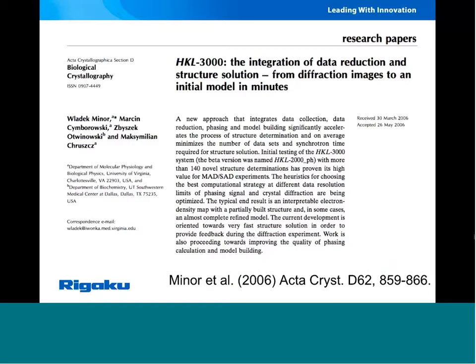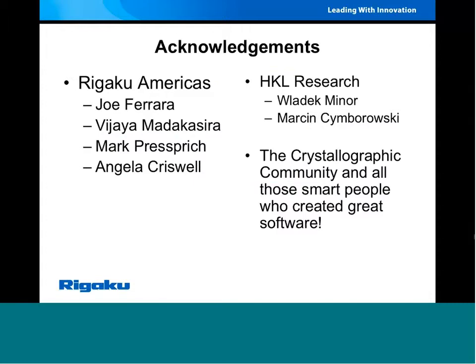This was published a few years ago, and there are many other packages that also do structure determination from the FOBS to the final model. I think many of you know about Phenix, the Phenix package with the AutoBuild and the AutoSolve. There's HKL2Map. You can use the CCP4 package, and there's some others out there. Today I'll just concentrate on HKL3000, which we're using in our lab.